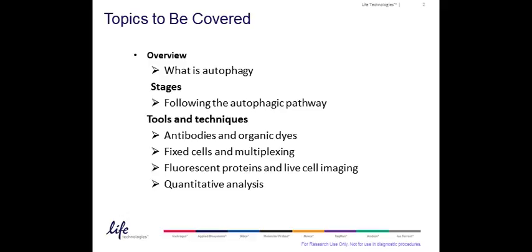Our goal today is to introduce you to the different analytical techniques and the tools that can be used to study autophagy. First, we're going to describe autophagy and the role it plays in cellular function. Then we can identify key features of the autophagic pathway to determine which steps are open to interrogation and what tools we might use to gain insight into the processes.